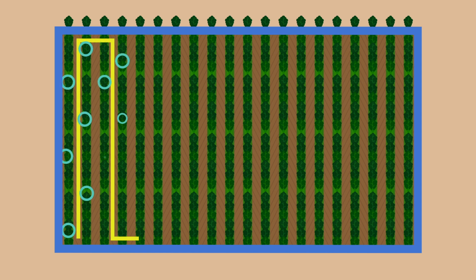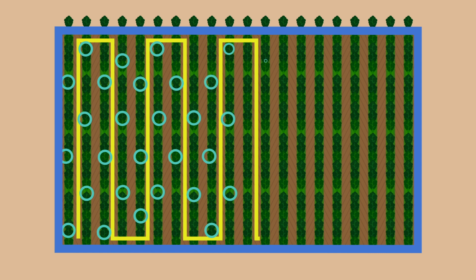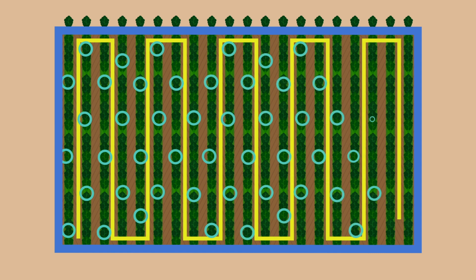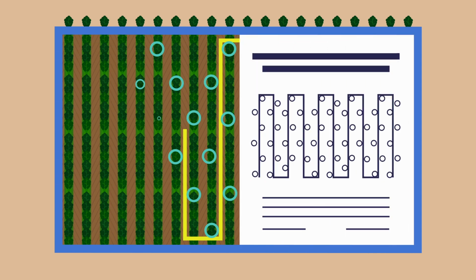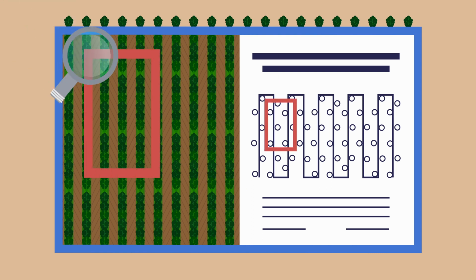Randomize the sampling location and distribute evenly over the entire lot. Walk the lot in a pattern that results in samples inclusive of the entire length and width of the beds. It is recommended to document the specific sample location. Knowing the specific locations can assist with root cause and investigative analysis.